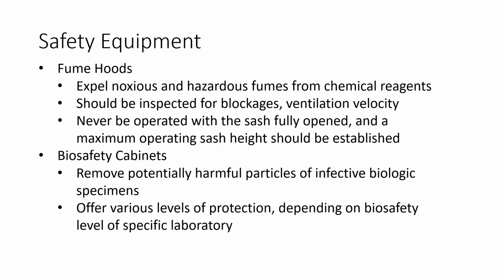Biosafety cabinets remove potentially harmful particles of infective biological specimens. They offer various levels of protection depending on the biosafety level of the specific laboratory. So there's different types of biosafety cabinets, but their goal is predominantly to filter the air and recirculate it into the room. So you're going to be using certain types of microorganisms within the biosafety cabinet, those are going to produce spores or toxins or different types of particles that can be released, or the microorganisms themselves. Then the air inside of that biosafety cabinet will go through a HEPA filter system, and after the HEPA filtration, that air will recirculate into the room.